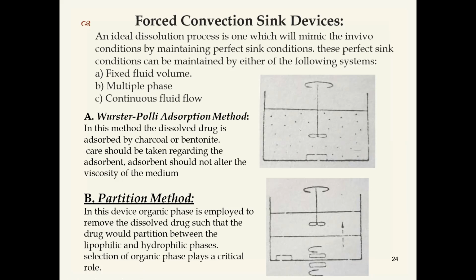We can predict the bioavailability of the drug. By conducting dissolution studies in vitro, we can predict in vivo conditions. That's the reason we need to maintain sink conditions. In vivo, the sink conditions are maintained, but in vitro they are not maintained. So we need to maintain sink conditions.